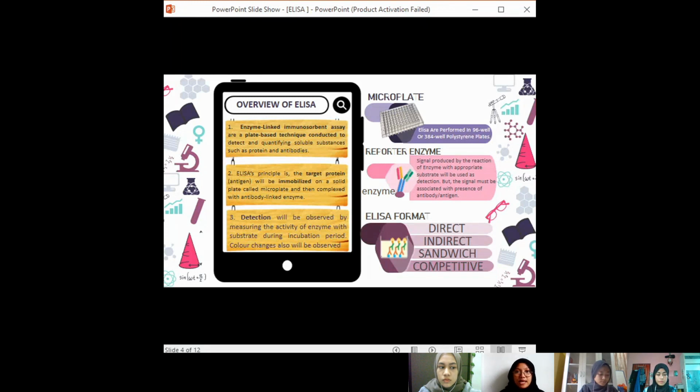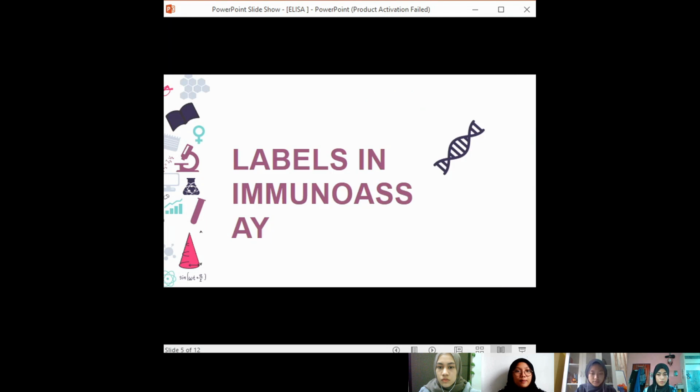Okay, ELISA has four formats. First, direct, indirect, sandwich, and competitive. Next, let's look at the labels in immunoassay. Thank you, Mira. Then we are moving to labels in immunoassay.